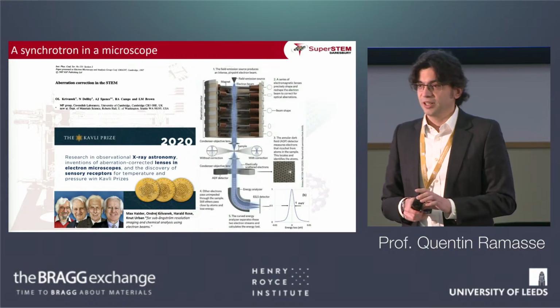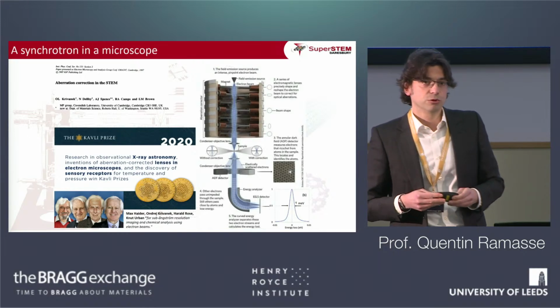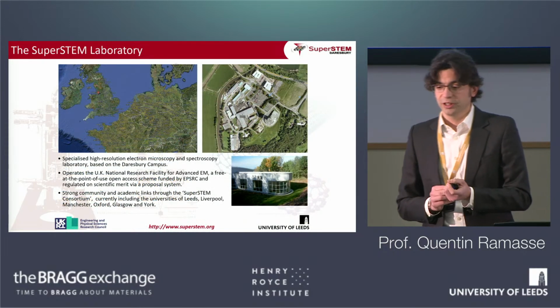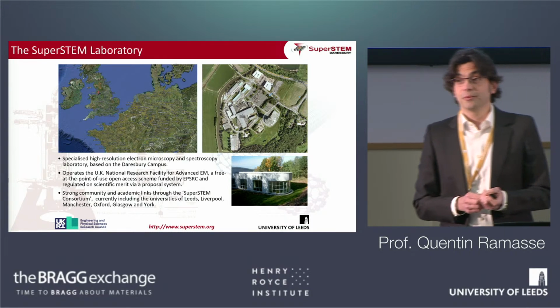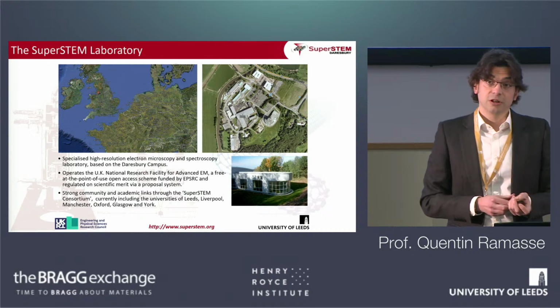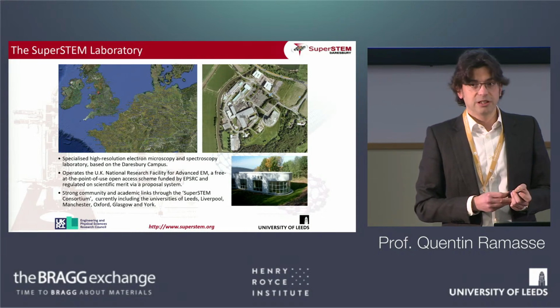It's not a phrase that I've invented, it's something that came from Nick Brown, who back in '97, at the same conference where those aberration correctors were being introduced, suggested that this should be the basis for creating a national facility. And in a rather shameless fashion, I am duty-bound to advertise very quickly the fact that I work at SuperSTEM, which is the EPSRC national facility for advanced EM in particular, and where we focus on these types of instruments, single atom sensitive STEMs, and it's a free at the point of use facility.